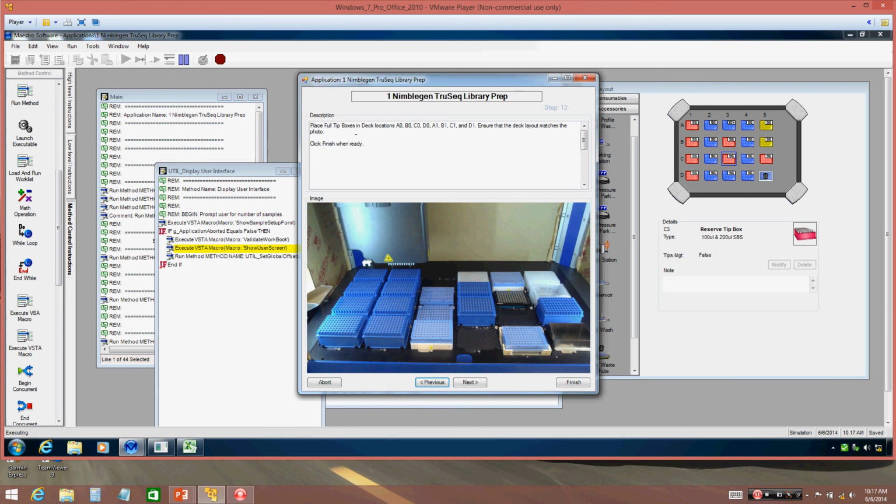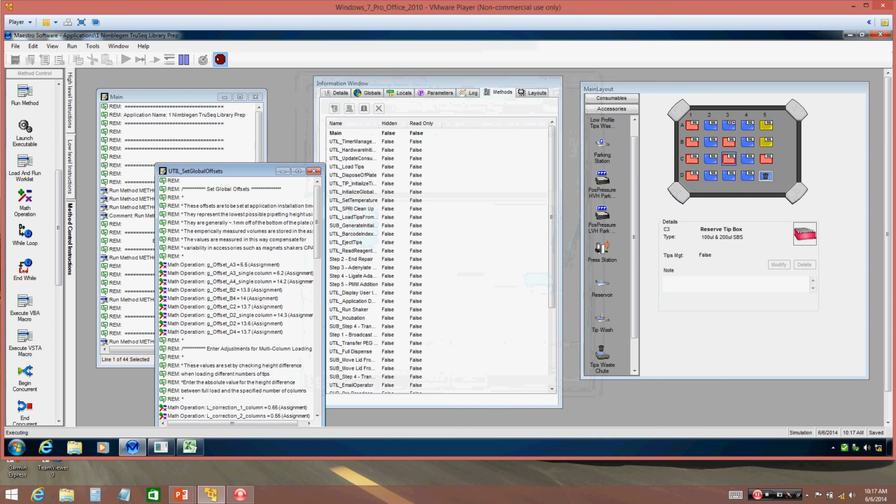Well, just click finish and you say yes, and essentially the machine will run whatever process that you want, and at the end of the day you collect your sample. It tells you where your sample is, and usually they end up on a locator that's at 4 degrees, since each one of those locators can actively be heated or cooled dynamically through the method.